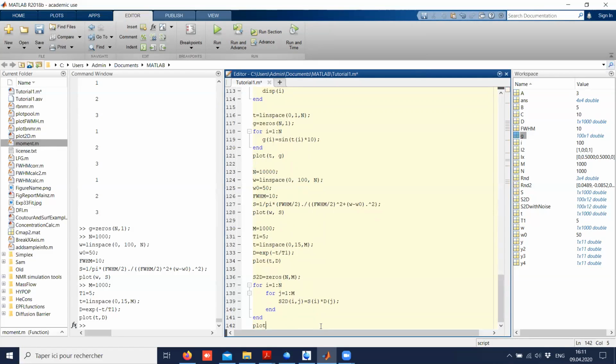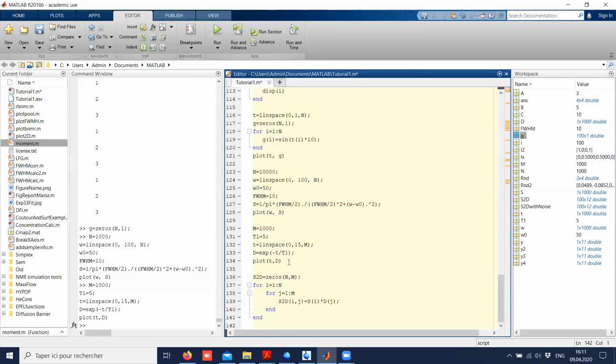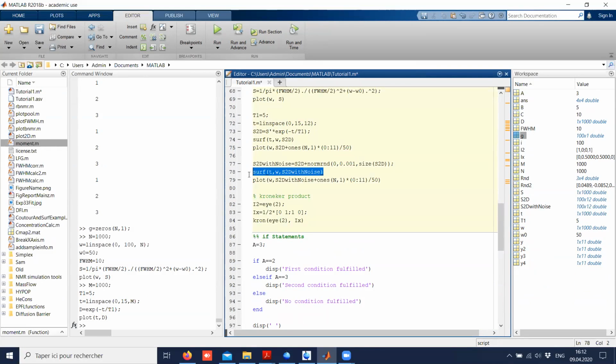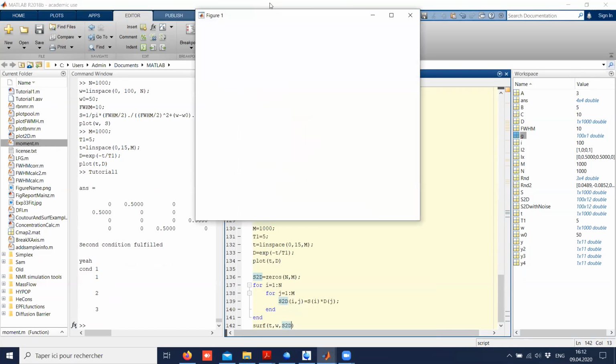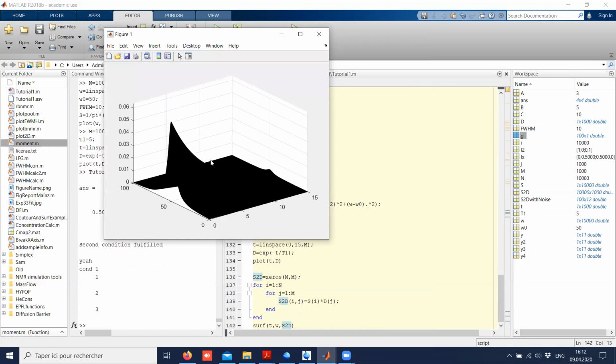So now I can do the same plot as I did earlier. I'm gonna call it back, this surface plot. It's without noise for this one. So now it's computing. The result is very slow. Got that many points. I just have to wait. Yeah. So of course now it's all black because there are so many points that we don't see the colors anymore. And when I try to turn the surface, it's very slow.